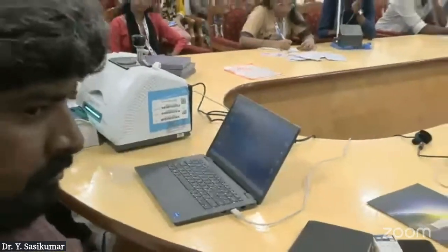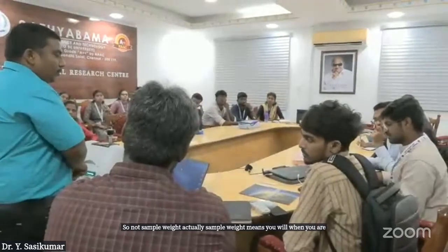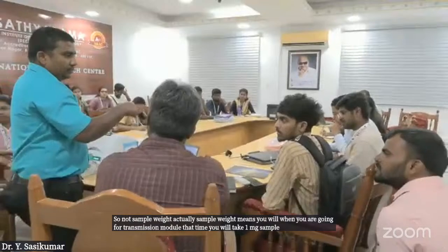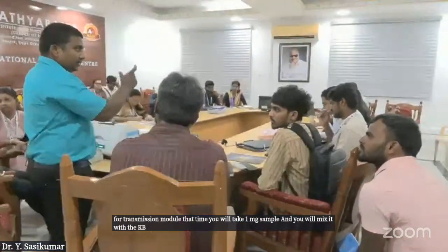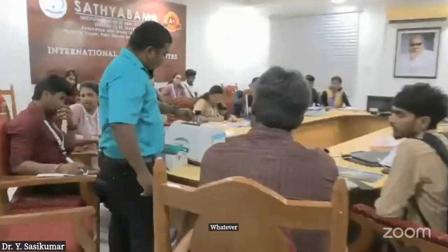Sample weight? No, not sample weight actually. Sample weight matters when you are going for the transmission module. That time you will take 1 mg sample and mix it with KBr. In that case you need to go with weight. But here nothing, whatever sample, this area has to be covered.